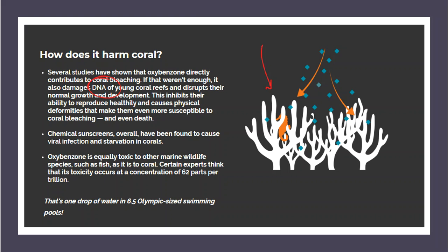Well, you're telling me that people slathering sunscreen on their skin would have this effect? Kind of. Because this actually happens at 62 parts per trillion level. Okay? Parts per trillion. Most of the time, we work on part per million level. This semester, we had one lab where we went to part per billion level.